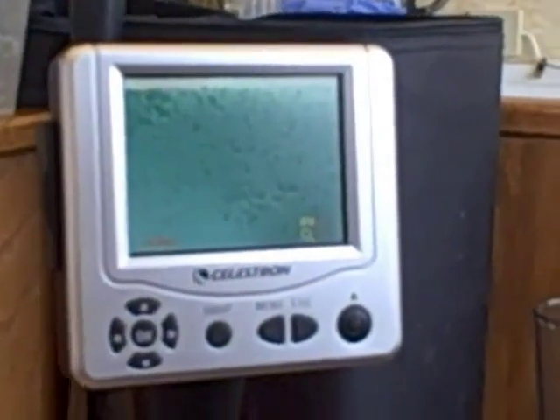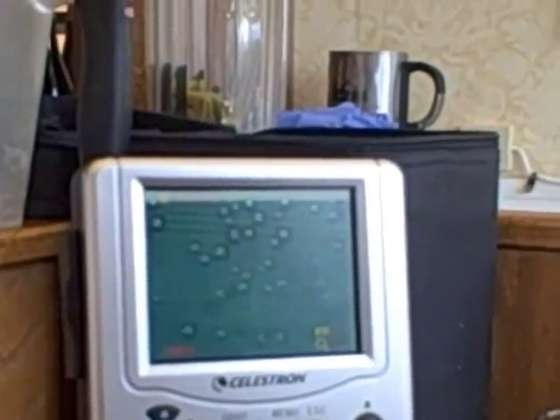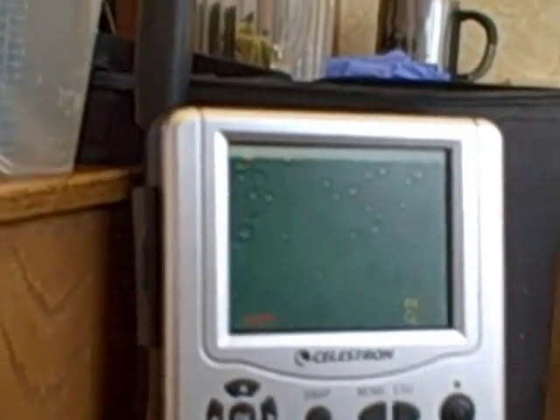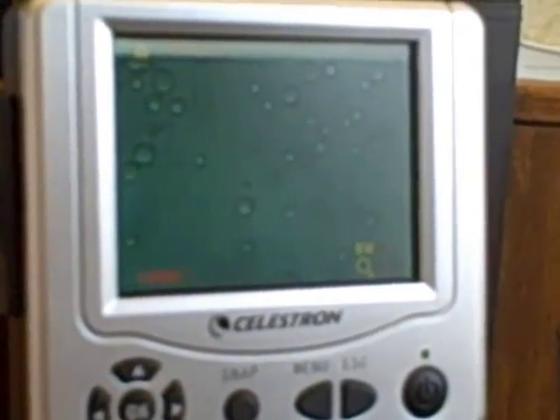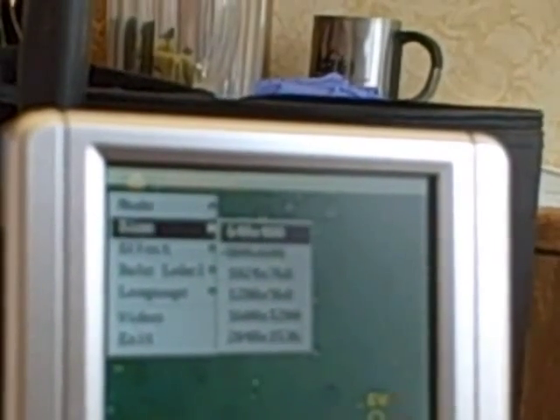There they are. Let's see if I go to this tower — that's too much. You can see the E-cells, but I need to zoom out. I can't even see a blue one right there. I need to zoom out. I'm going to go back to the 10X and zoom in.